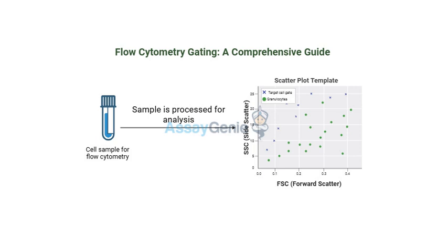This is really cool. It's like we're giving our detective kit some serious high-tech upgrades. And speaking of upgrades, let's talk about another advanced technique, Boolean gating.